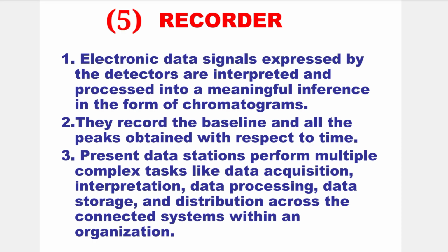And the fifth is the recorder. Electronic data signals expressed by the detectors are interpreted and processed into a meaningful inference in the form of chromatograms. They record the baseline and all the peaks obtained with respect to time.